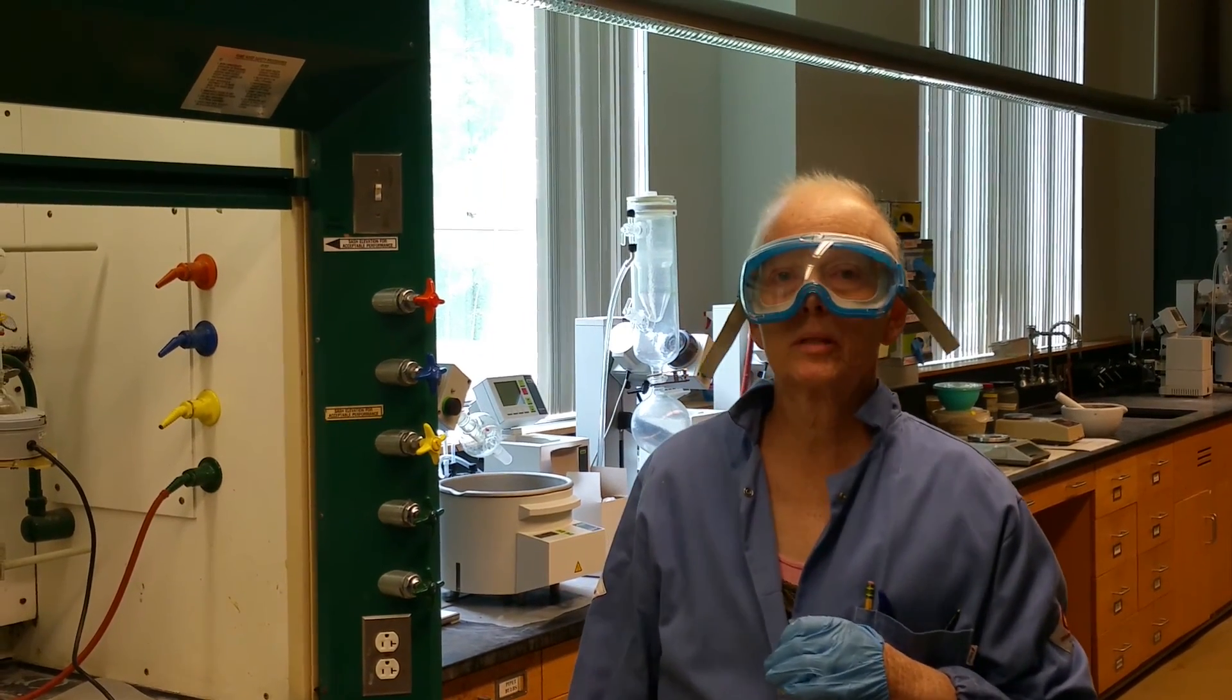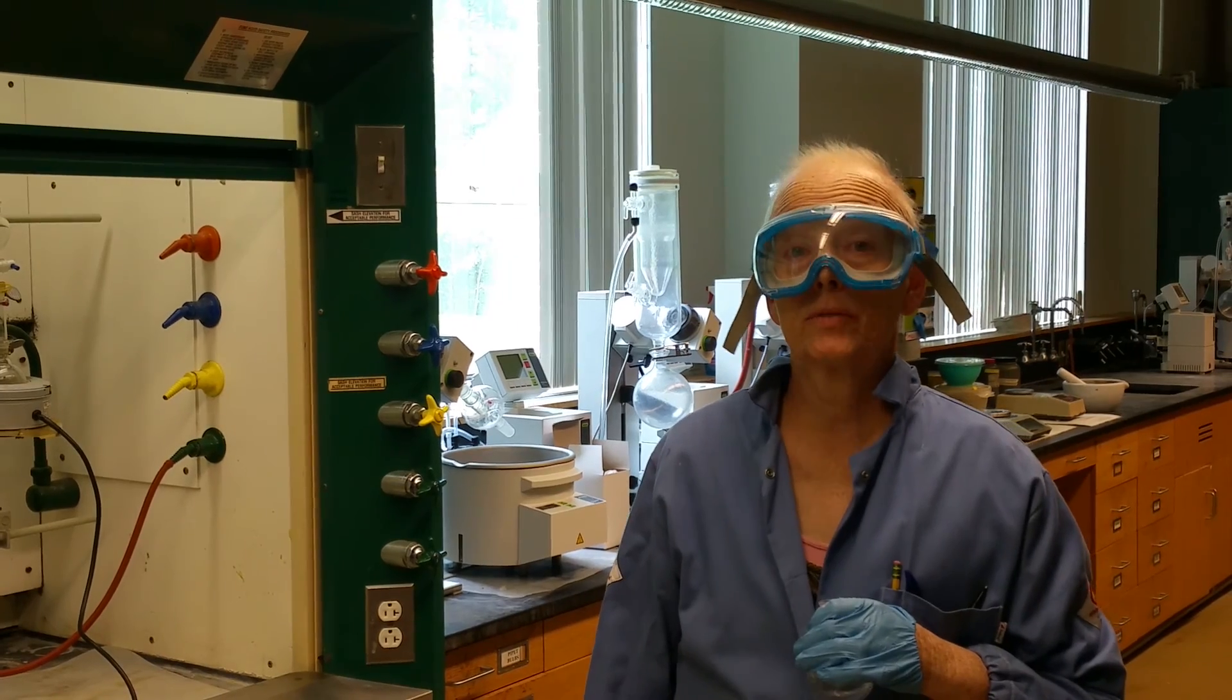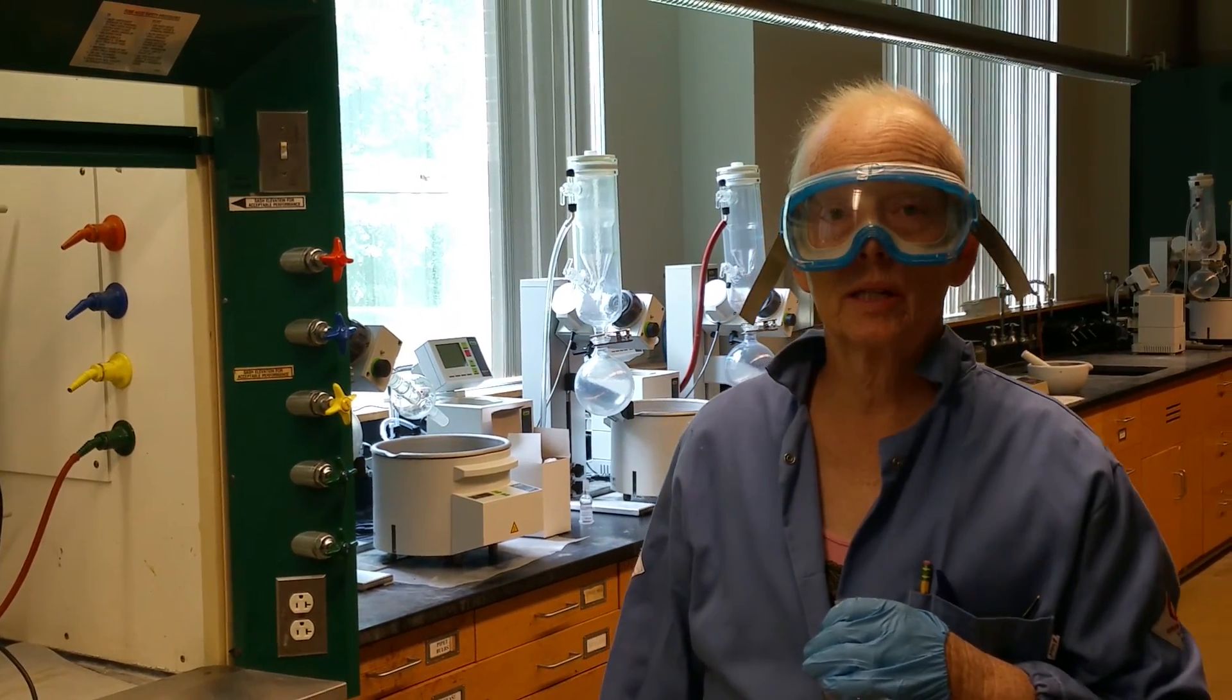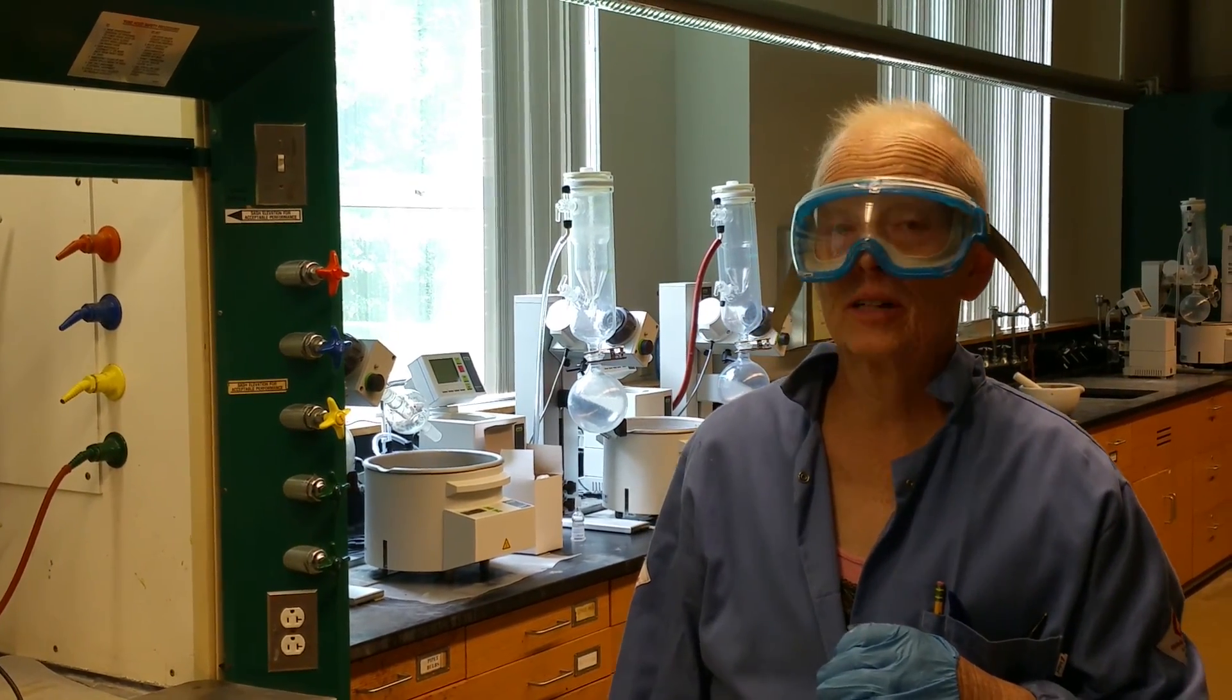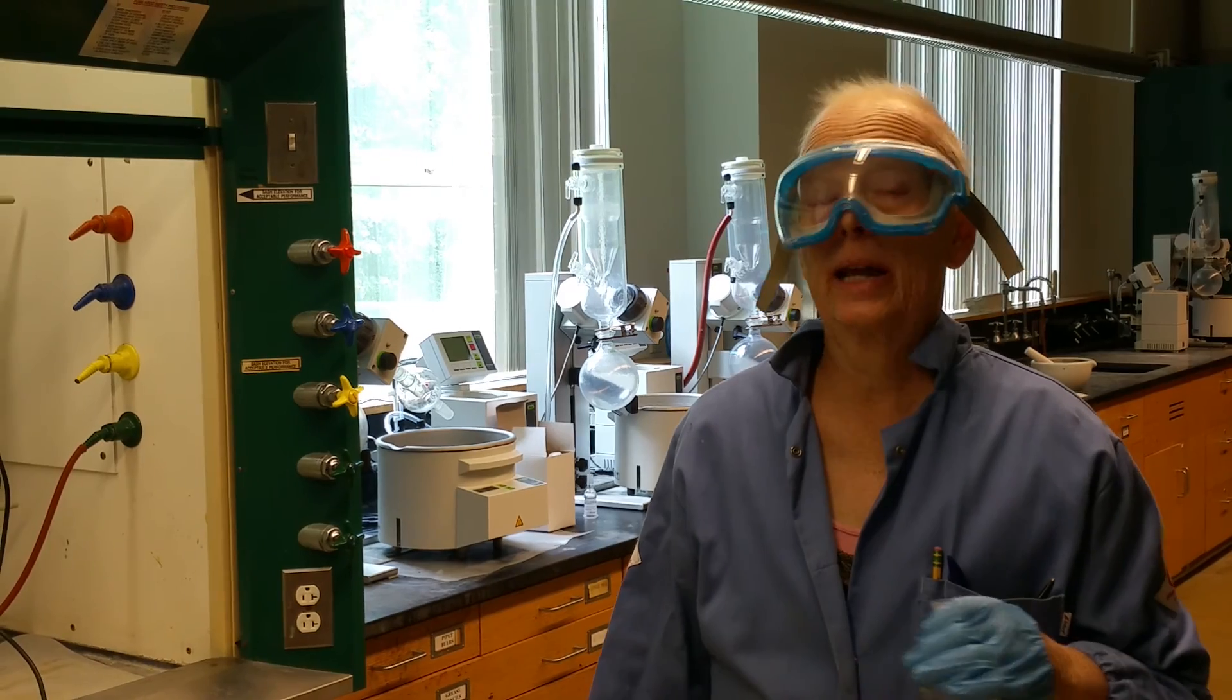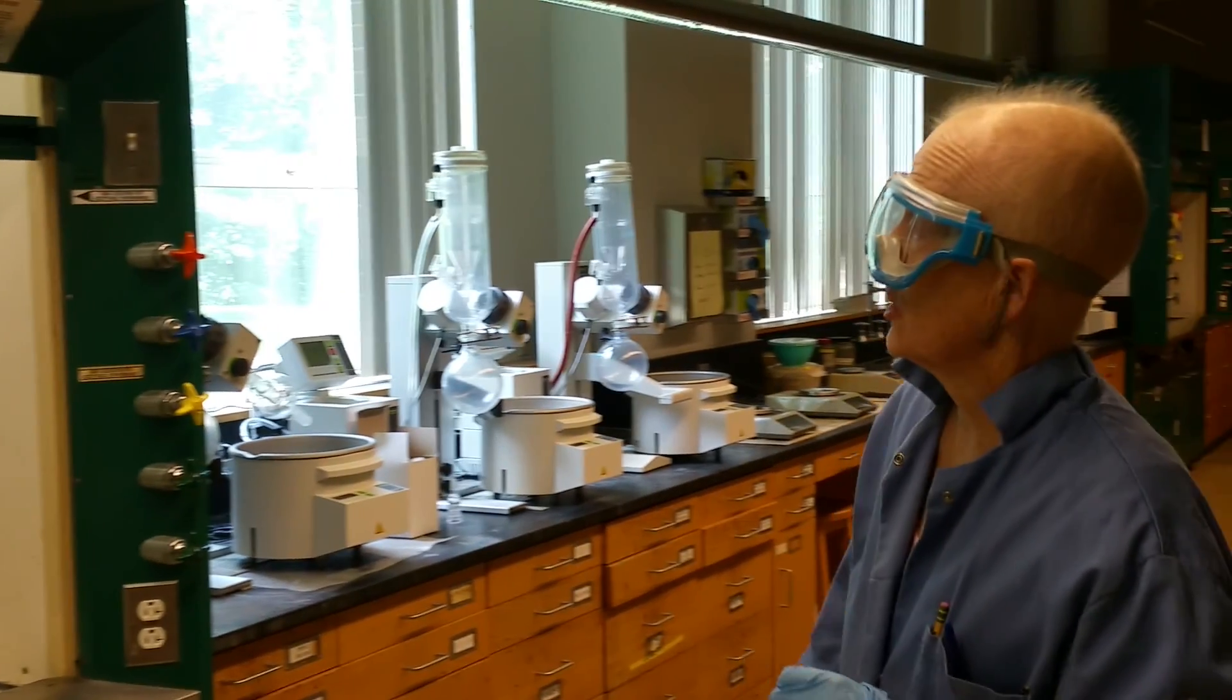This is Mariel Nurse Storms at Bryn Mawr College, and I'm making a video because we've got lots of new equipment in the labs, which is really exciting. Although there are videos on the website about using what is called a rotary evaporator, it was actually the first video we ever made.